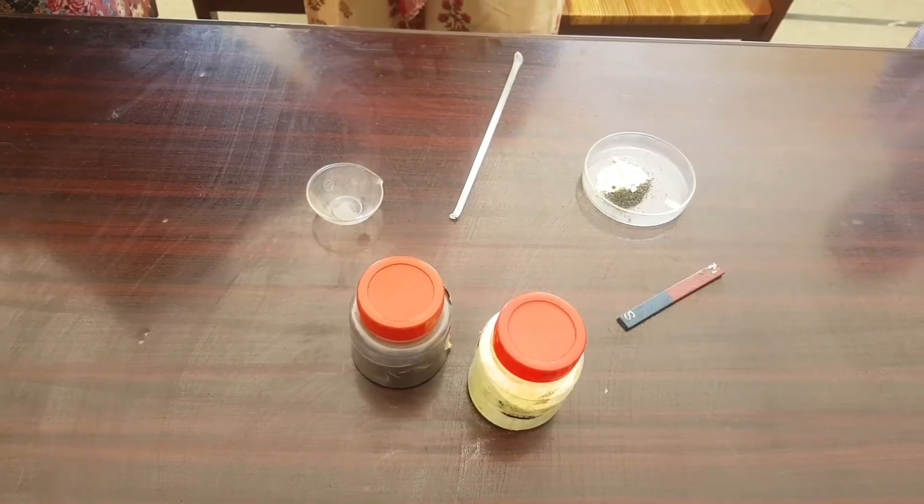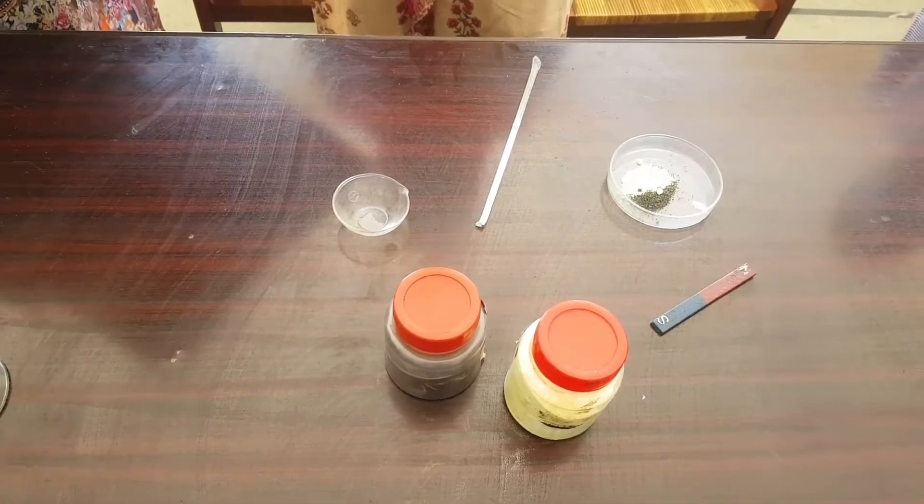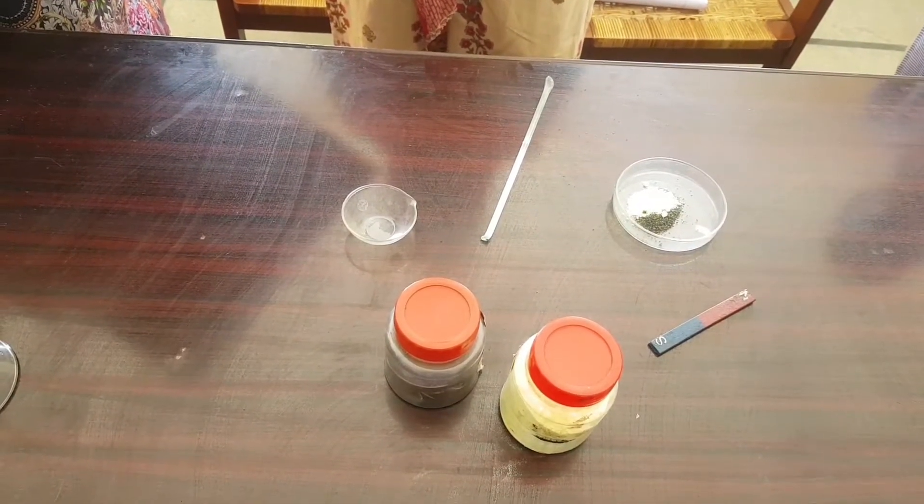I am going to start our experiment number 1. The name of the experiment is: separate the given mixture of iron fillings and sand or sulfur by physical method.